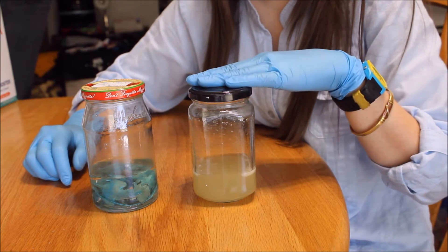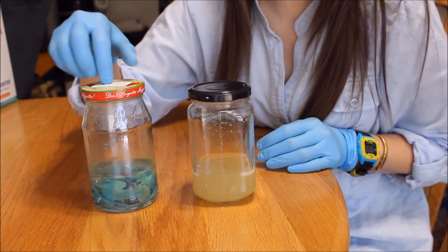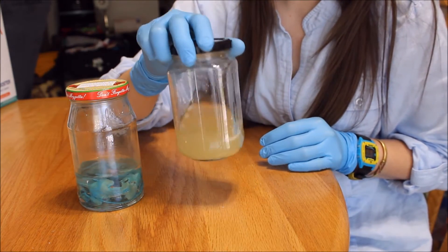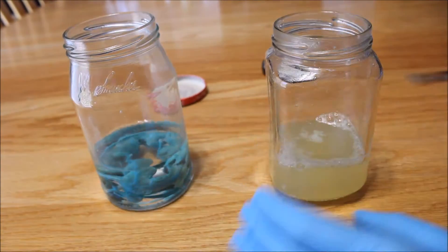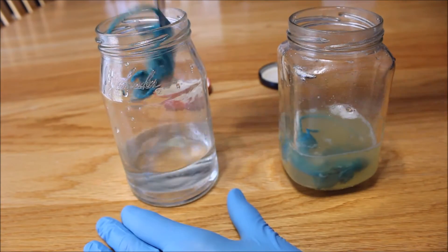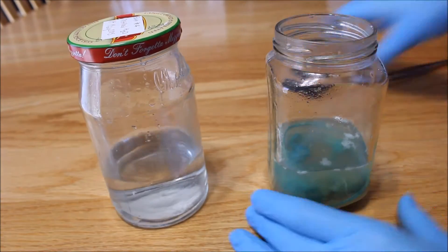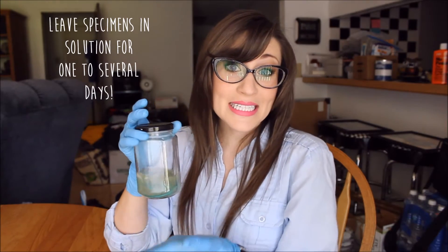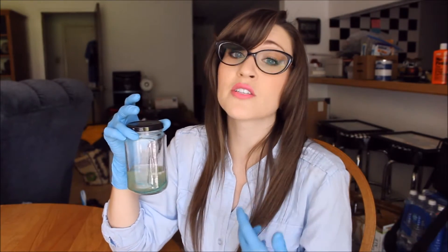Now that we have our Trypsin Digestion Solution complete, we're going to be transferring our specimens from the distilled water from the rehydration step into the Trypsin bath. Here are our specimens in our Trypsin Digestion Solution. We're going to be leaving our specimens in the solution for one to several days, looking for a limp specimen and for the muscles to become transparent so we can view the skeletons inside them.